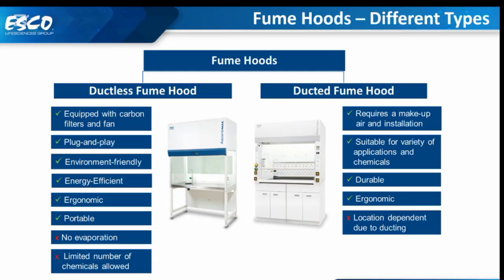Okay, so the ductless fume hoods rely on carbon filters, as I just showed on that illustration. They rely on carbon filters or other specialized filters to capture hazardous vapors.